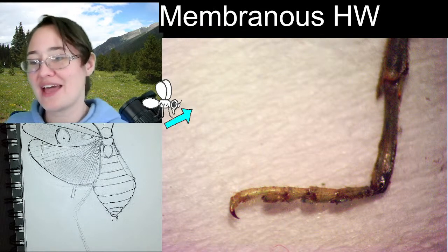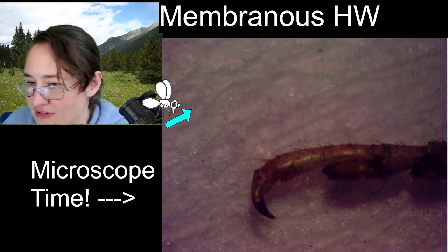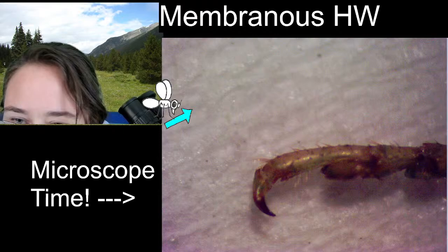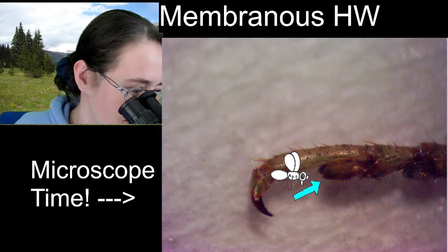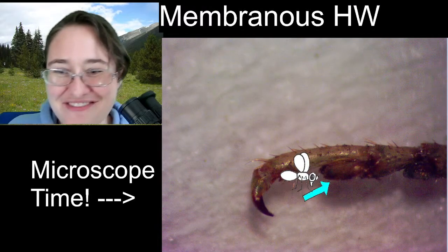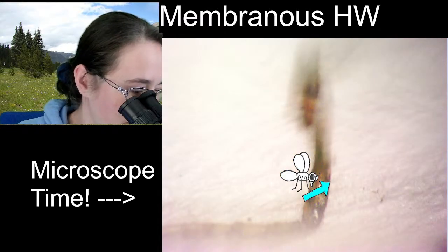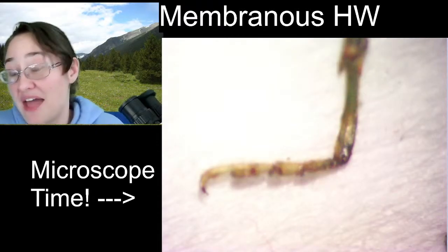Definitely counted 6 on the front leg, and I definitely want there to be six tarsal segments, but I am only counting 5 unless we decide that this little thing here is a tarsal segment. I don't know what it is. It looks like a growth. I don't think that that's a true segment. Alright, so if that's not a segment, then we are going to call it 5.